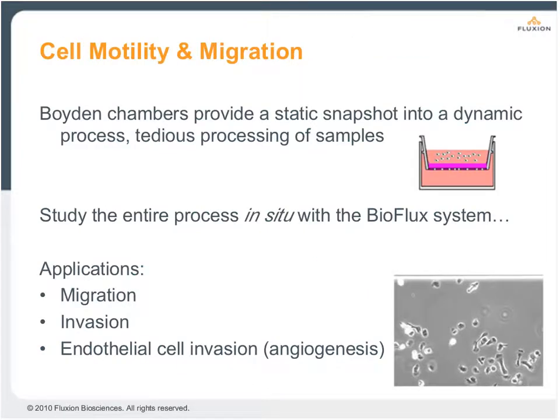And these are all going to be focused on cell motility and migration. Many, many types of cells are screened for their motility in response to compounds in chambers called Boyden chambers. You may also know them as transwell inserts. So what you can see is a little cross-sectional diagram. And the idea behind this type of assay is that you're creating two compartments. So the bottom compartment may contain a chemokine, it may contain a conditioned media, and the top compartment contains cells.